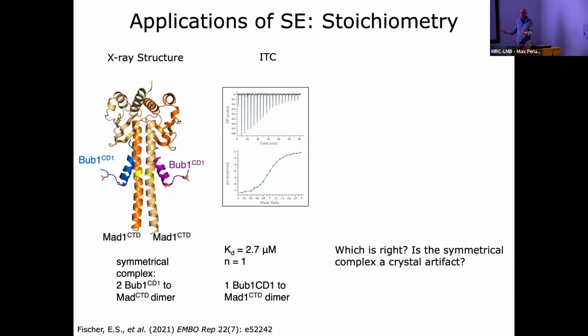And that's what you expect, isn't it? It's a coiled-coil, binding similar sites. It looks quite symmetrical, it looks quite nice. Then she looked at the binding constant by ITC, where you titrate the peptide into the protein, and the stoichiometry was 1. It should have been 2, because you expect two to go in, but it's only 1. That was a bit weird. So the question is, is the crystal structure not right? Is it just a crystal artifact about how things have packed together?